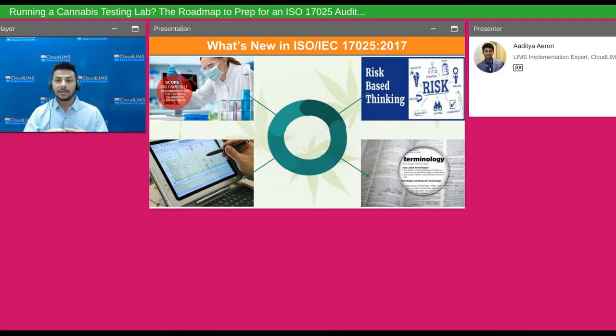You need to take care of all the types of analysis you will be performing, all the types of equipment you would be utilizing. Do you have the adequate guides in place so that you don't leave any stone unturned, and you can clear every part of the audit processes and become a successfully accredited lab?